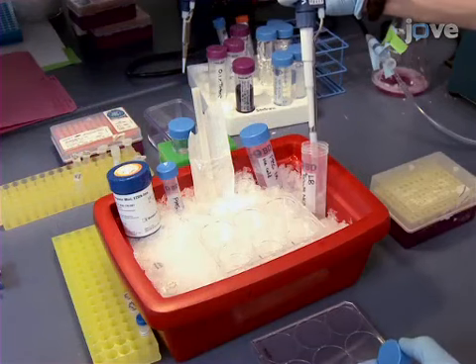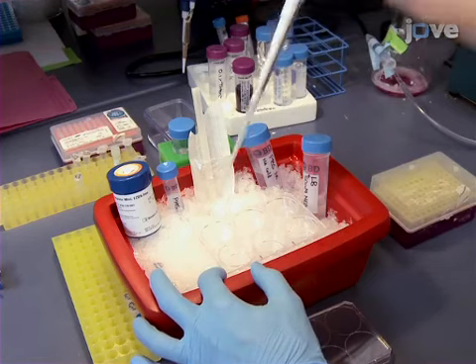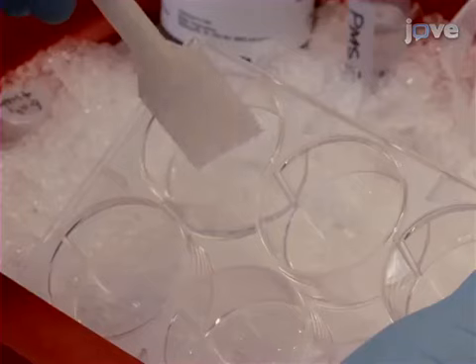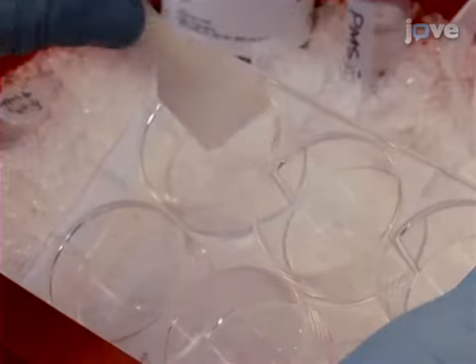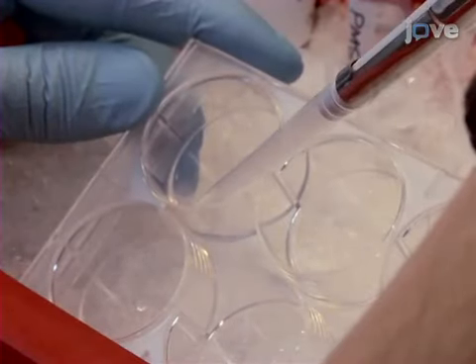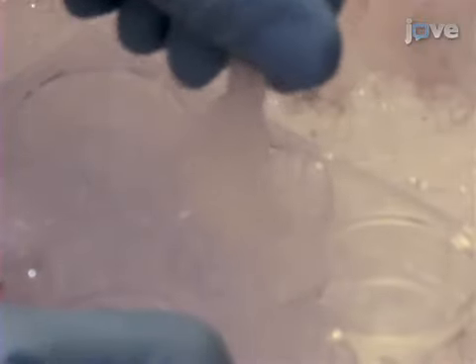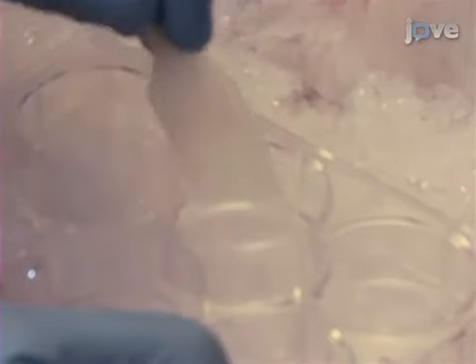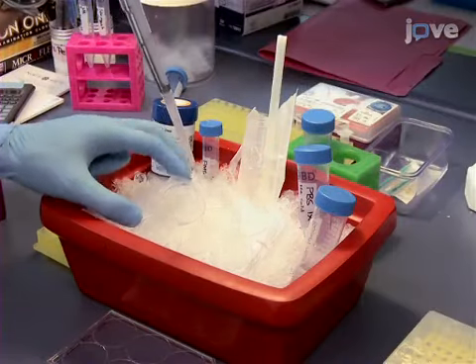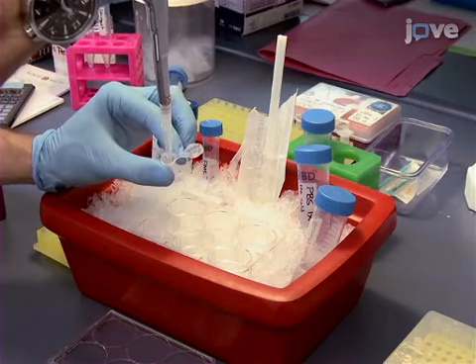Next, add 300 microliters of lysis buffer plus 50 millimolar NEM to the first well of hippocampal neurons, and scrape cells using a disposable cell lifter. Collect the cell lysate and then discharge the lysate into the next well of that group. Scrape the cells within the second well using the cell lifter. Collect and repeat using a third well if needed to further concentrate the lysate. Collect the cell lysate into a pre-cooled 1.5 milliliter microcentrifuge tube.